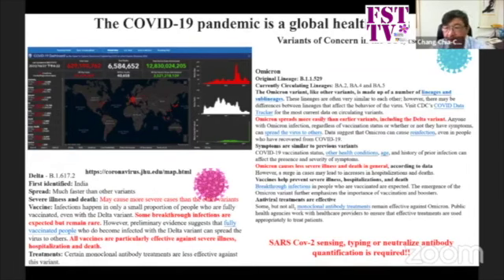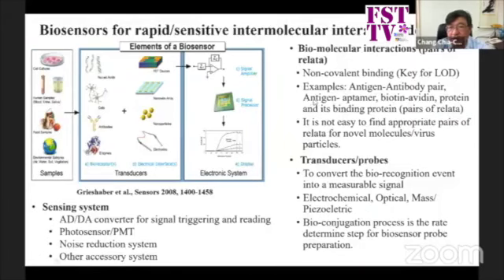During that time, people thought about how we can detect this new disease and how to find it. It was not only interesting, but people also thought it was important to detect. So how do people do it? In general, a biosensor contains three different components.